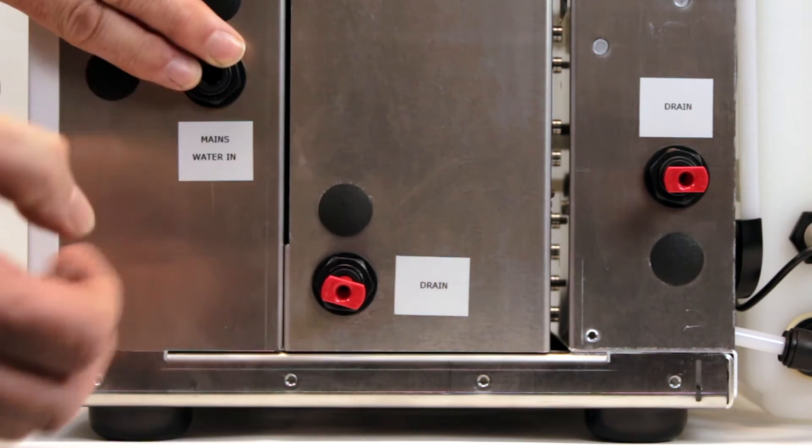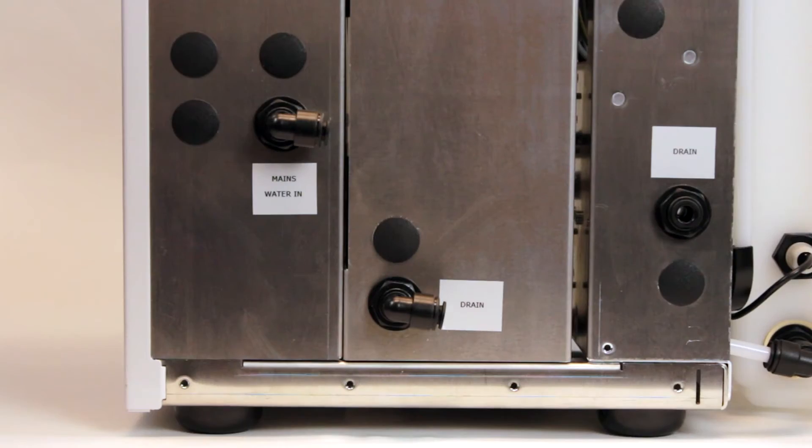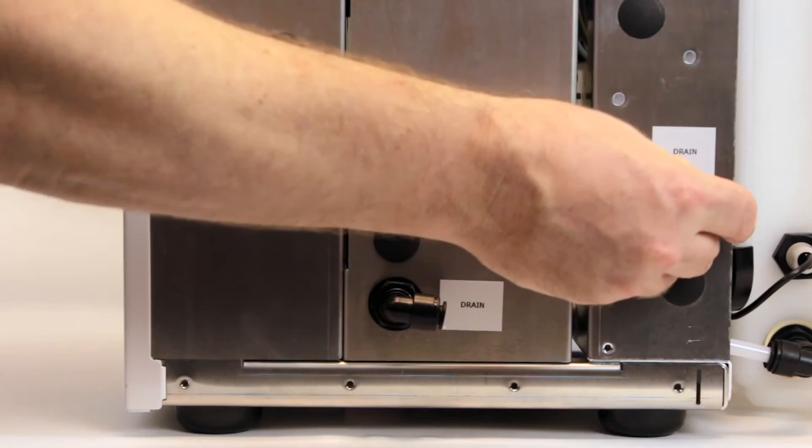First, remove all of the red transit plugs by simply pulling them out. Next, fit the stem elbows into the water inlet and drain connection.